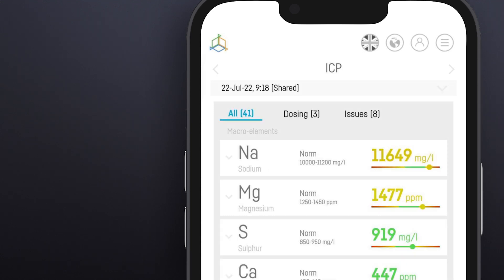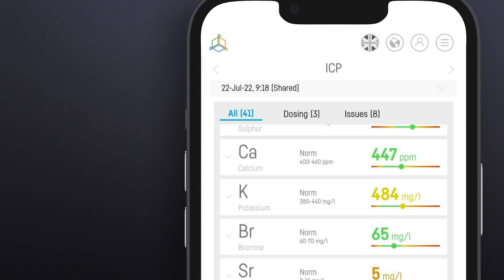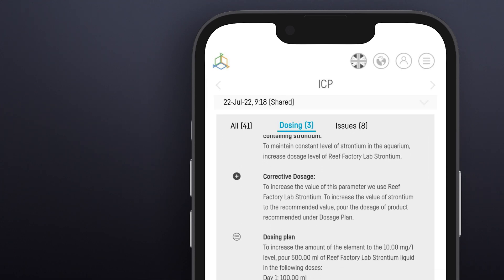They're categorized in three tabs. All, where we have all the parameters along with the results. Dosing, where we can find the micro and macro elements where the concentrations are too low and require additional supplementation.